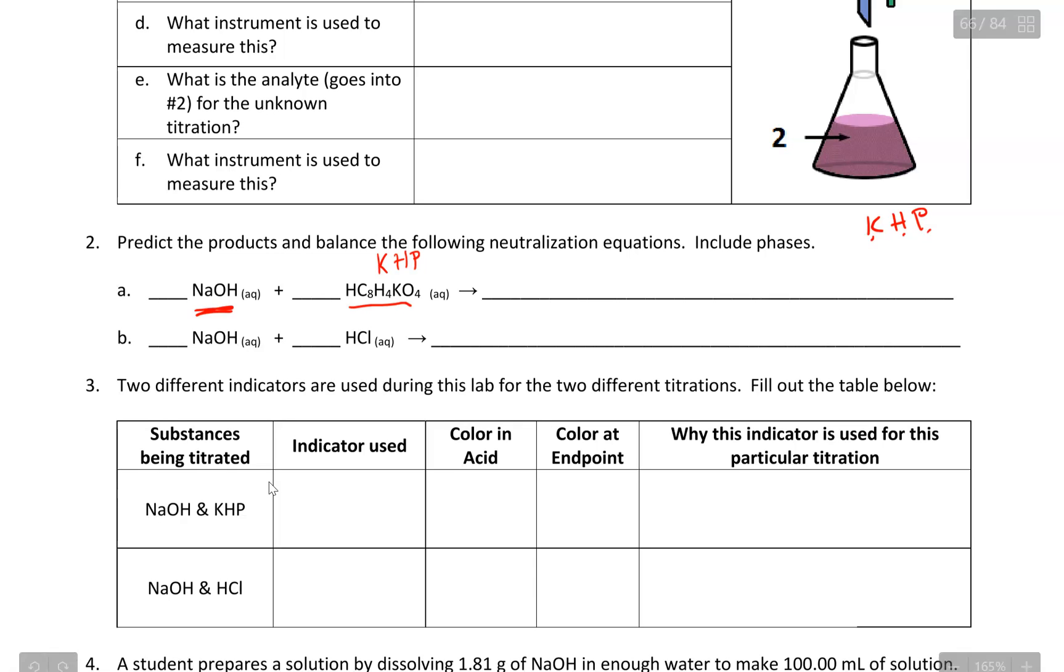If you leave the sodium hydroxide sitting out on the benchtop, it's going to start to suck in water from the atmosphere and almost look like it's melting. It's called being hygroscopic, the ability to absorb water. So when I take the mass of sodium hydroxide, I don't know how much of it is actually NaOH, and how much of that mass is water molecules.